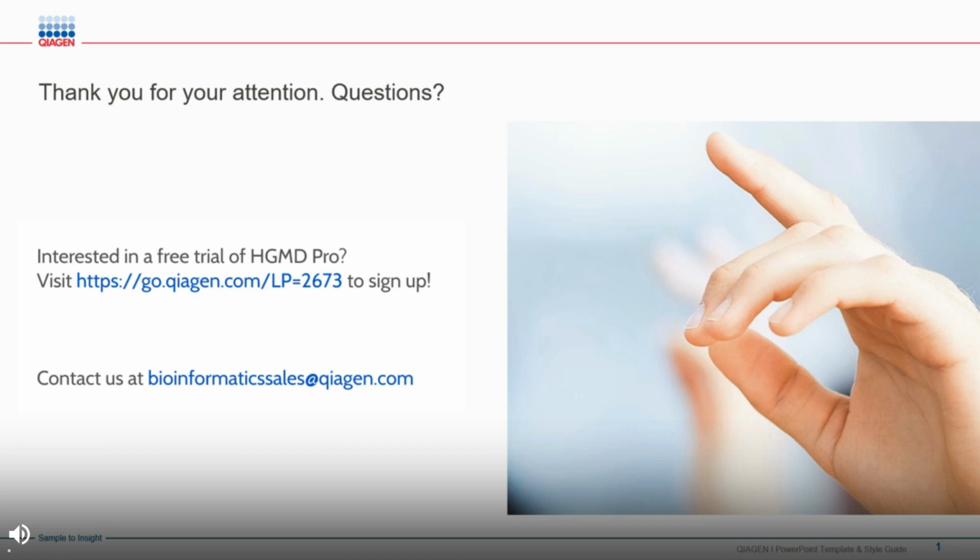And so the evidence is within those publications. And the curators who are reviewing this evidence always err on the side of adding something rather than leaving it out if there's any question about its association with disease, so that if future publications come out, this variant is kind of flagged for further review so that it can be revised in the future as more evidence becomes available.